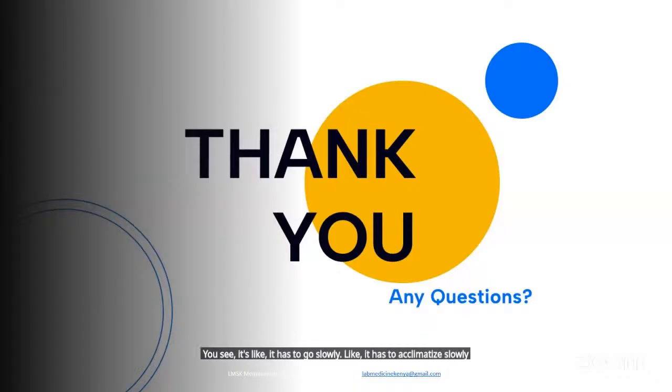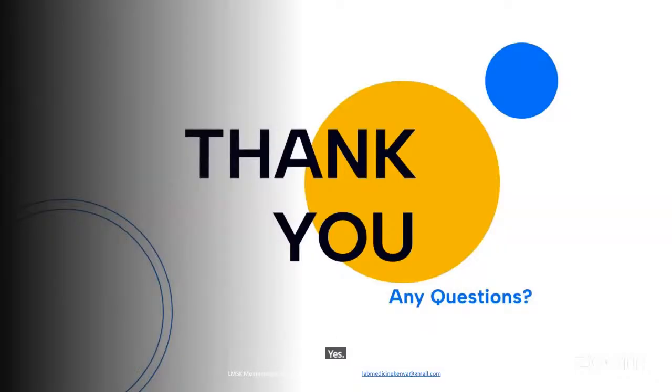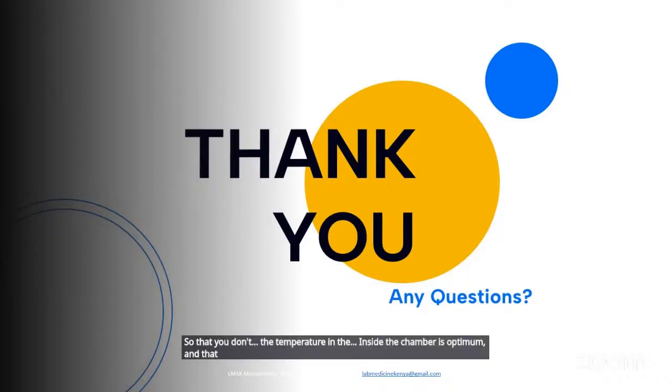So you have to switch on earlier before the frozen section arrives. And during operation, try to keep the lid of the cryostat closed, so that the temperature inside the chamber is optimum. And that optimum temperature is -20 to -30.